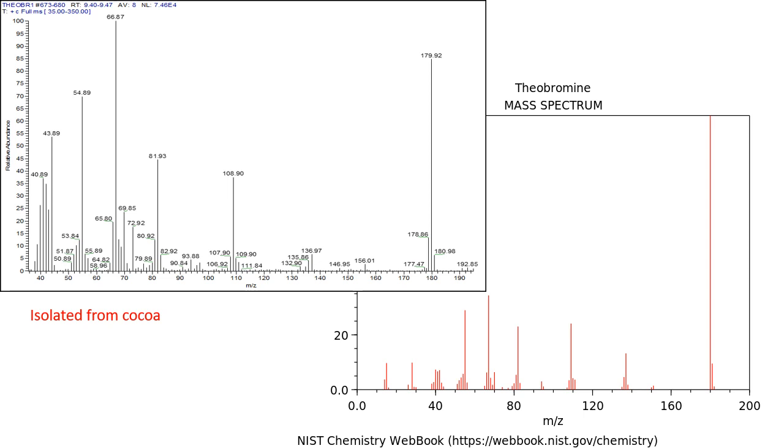This is a dramatic difference from any other spectroscopic procedure, and that makes mass spectroscopy the method of choice for all toxicological research and all toxicological determinations. If you can do mass spec, you do it.